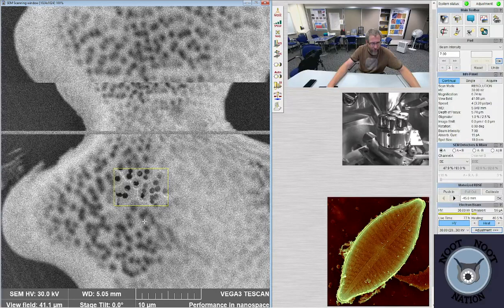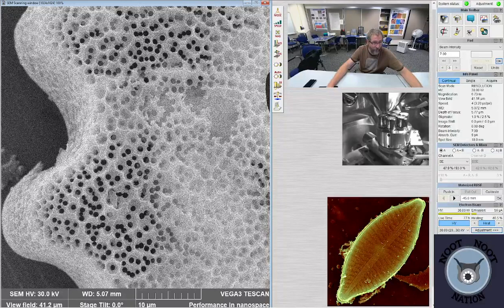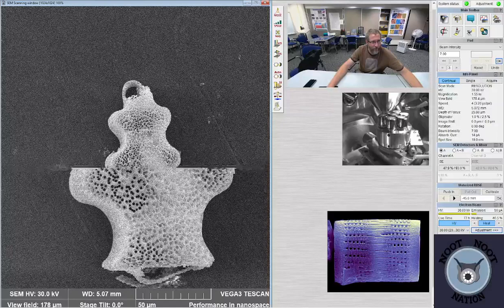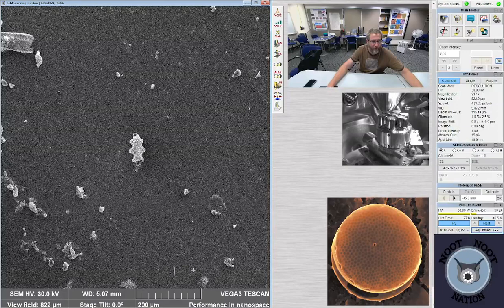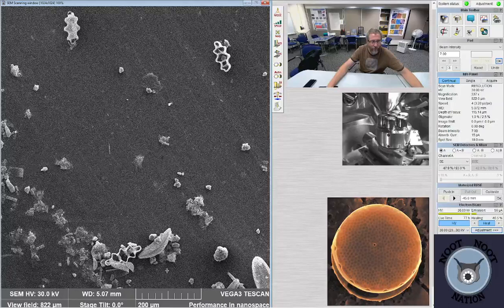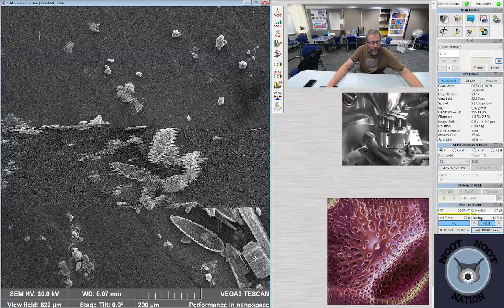It's pretty heavily dissolved actually, and the ends are all broken out, which suggests maybe it's been transported rather than living in the lake, which is also possible. It could be that they're blown in by the wind. The lake is pretty close to the coast, and it's very possible that some of these are actually blown in. It would be weird to have this many blown in, especially because they're all over the place in the sample.